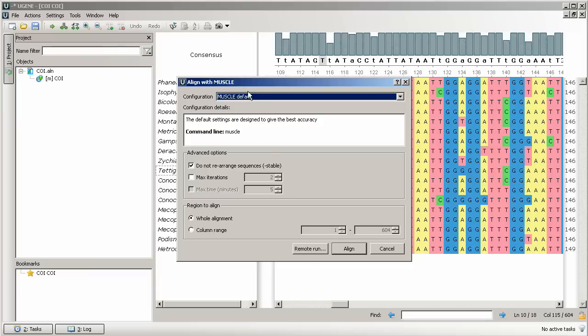Then select Align, Align with MUSCLE. In the appear dialog box we can select alignment configuration. We'll choose the default one.